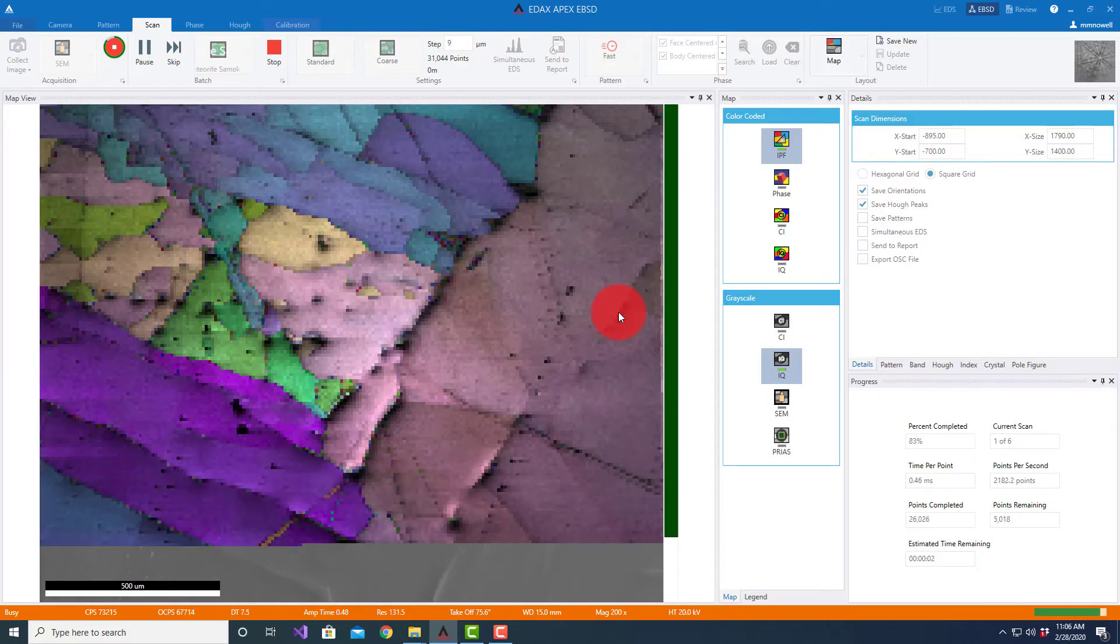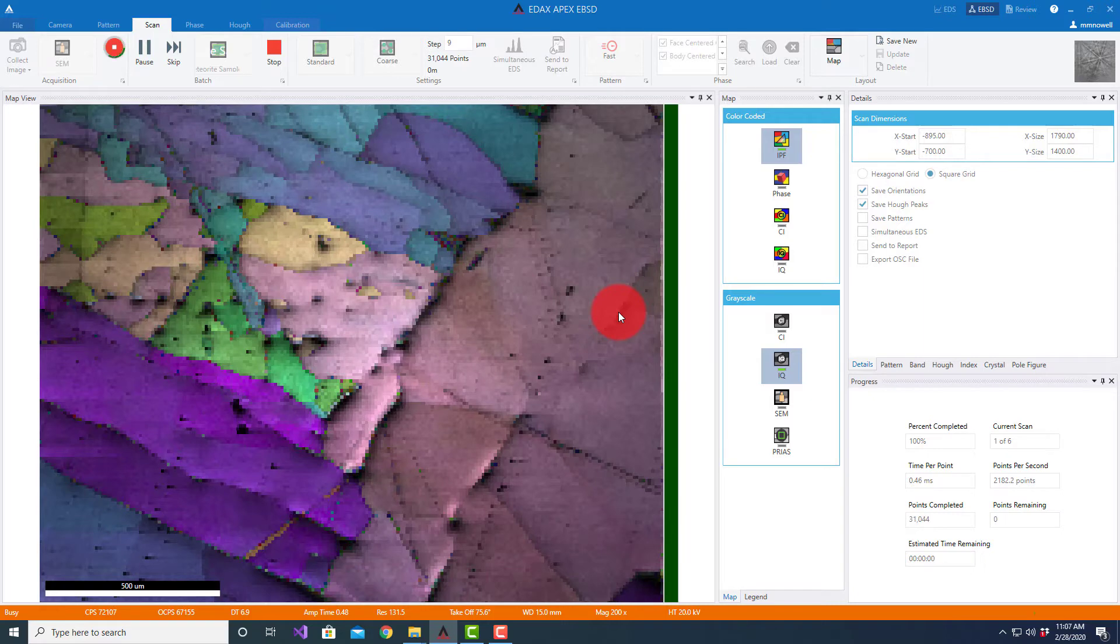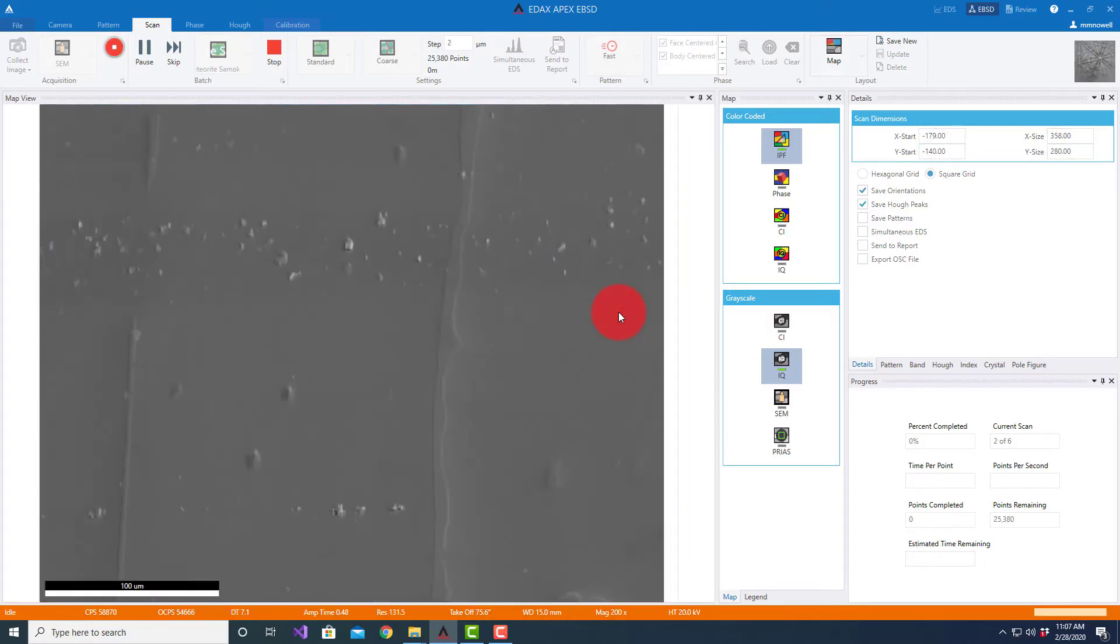So now it's completed one. It'll now go to the next position and change the magnification.